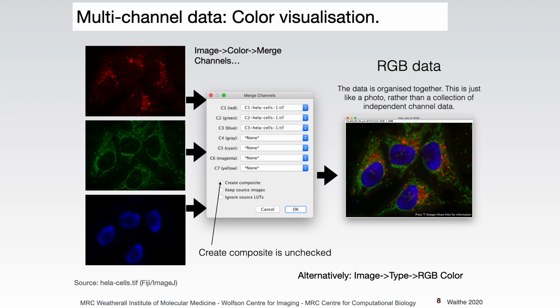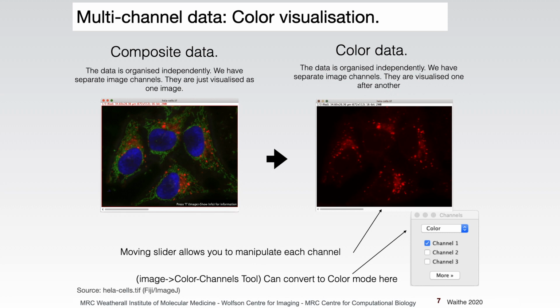And if we had 5 channels or more going into this, they'd now be merged as RGB. So if we split this, we would lose data. So I just really want to highlight that to you. And you can see here it says RGB, right? And if we go back, we see it says 16-bit here because it's telling you the bit depth of the individual channels. And here it says 16-bit as well. But it's just the way that it's separated.